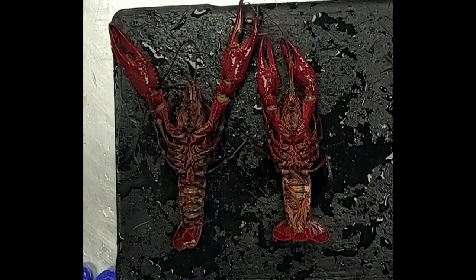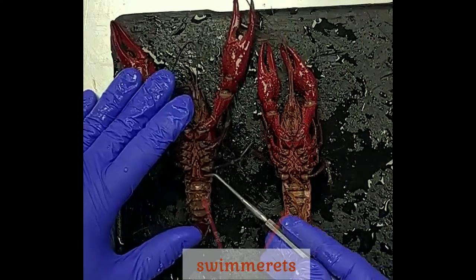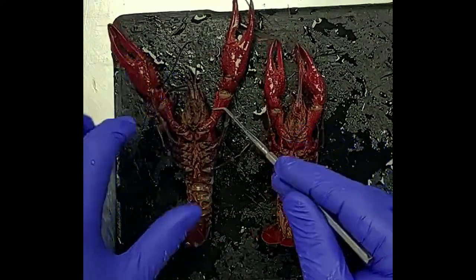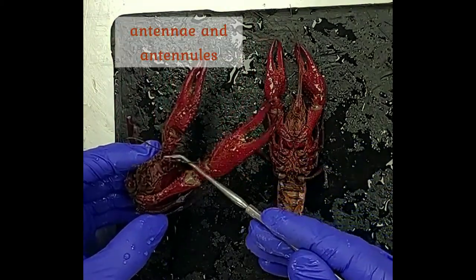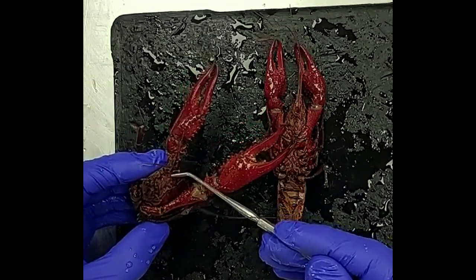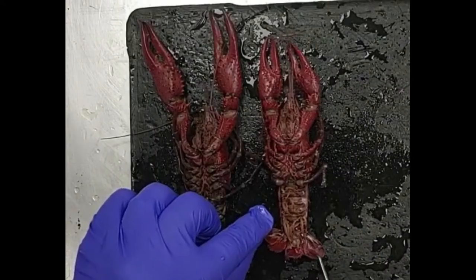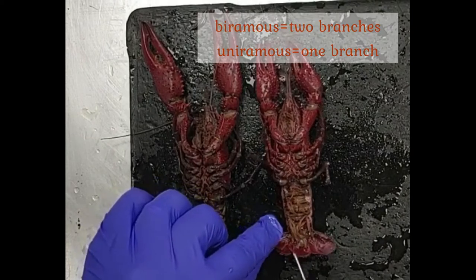If we flip the crayfish over so that the ventral or belly side is up, we can see some other appendages. Down here on the abdomen, we have the swimmerettes. Up towards the anterior end, we can see the antennae and the antennules. Crustaceans have two pairs of antennae — that is one of their defining characteristics.